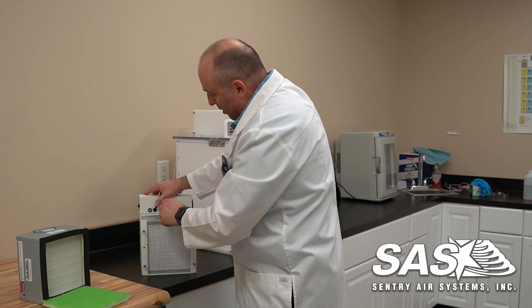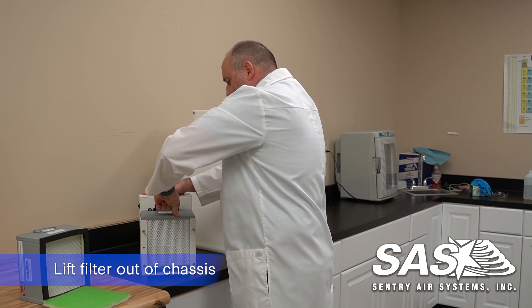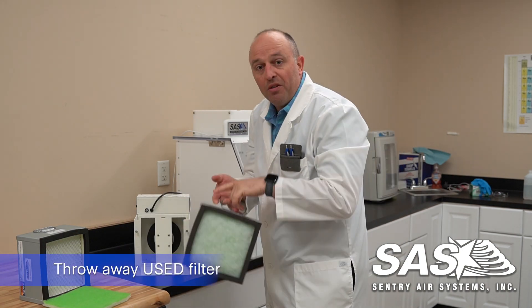From here I'm going to hold the power cord up, lift the handle, and the filter is going to want to slide right out. Here we have our filter — your HEPA filter and then the pre-filter — so we'll dispose of this.